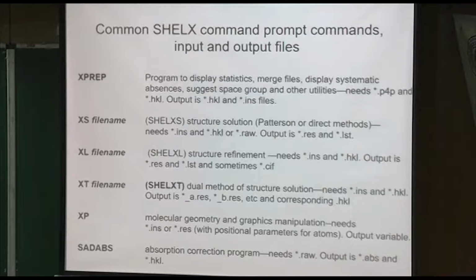I will be using it from the command prompt. I'm just so used to it, and most of the old crystallographers like me use it. So I can tell you that. Why would you use anything else? It does everything you want. It's great. And it can also output graphics for publication. So we'll be talking about those programs by and by.